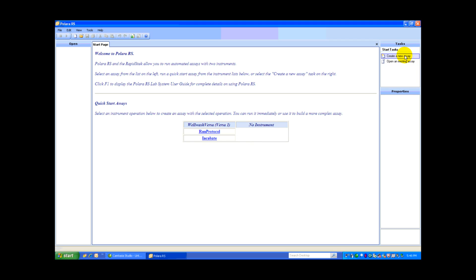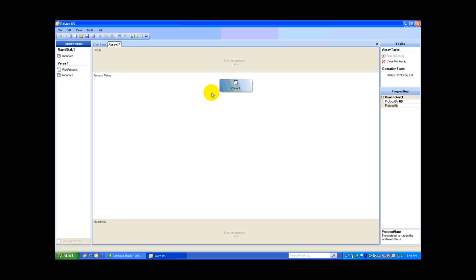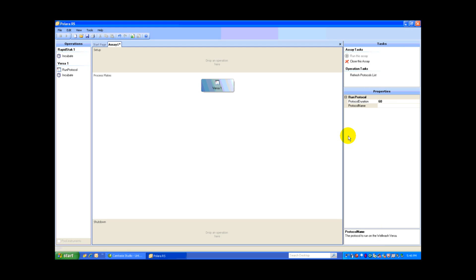Next, we go to the upper right. We create a new assay. Here is our Process Editor. All we need to do now is drag and drop functionality from the Operations section over into our Process Editor. I'm going to select Run Protocol. I'll drag that into our main frame.